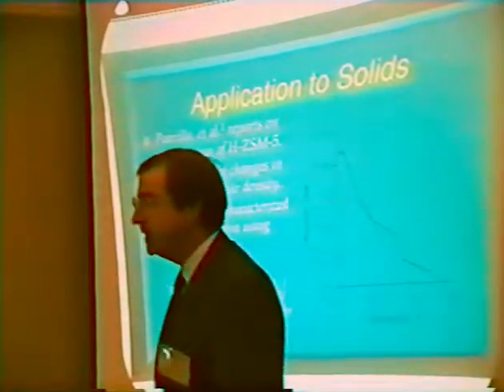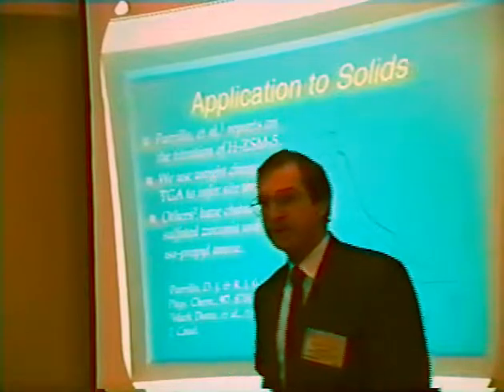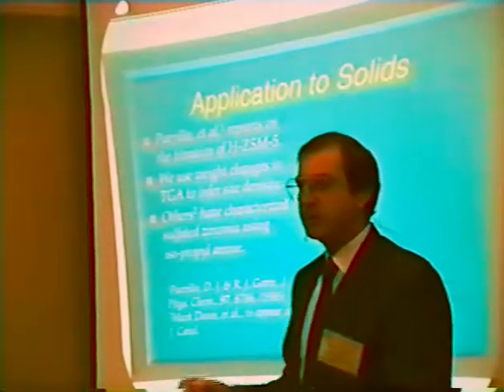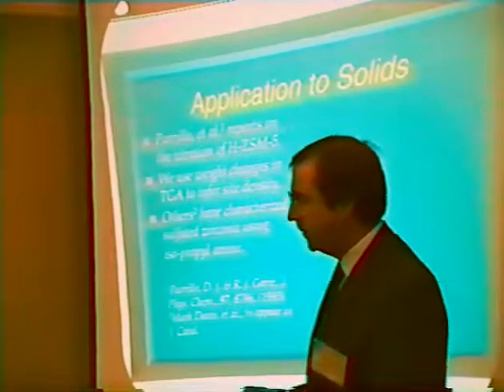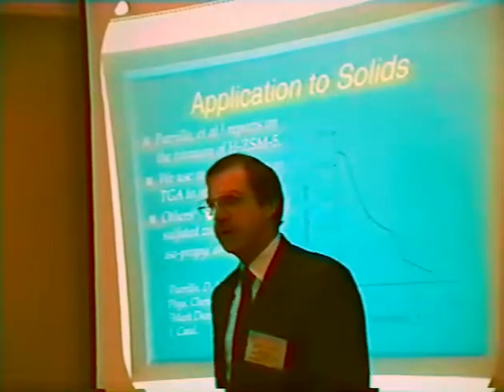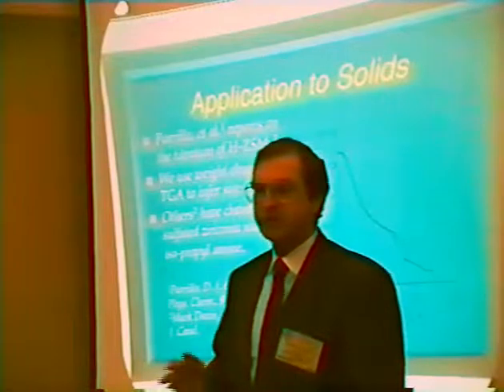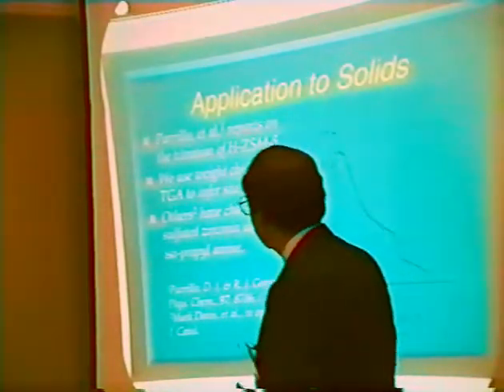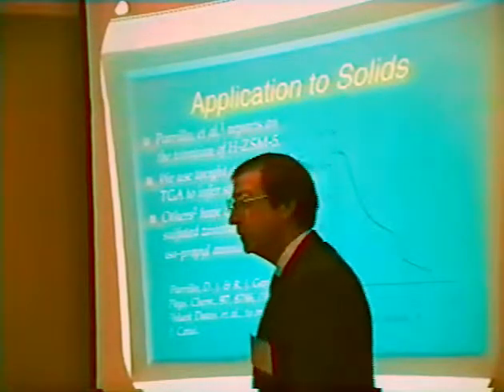So this technique is used to count Bronsted sites that have a sufficient activity towards this particular reaction. And it's hoped that this measurement might also be in some way related to some chemistry like we've seen this morning. That's the idea in using the tool.